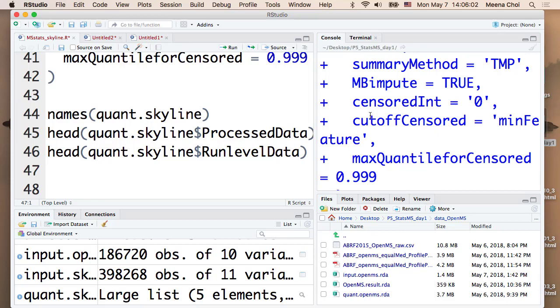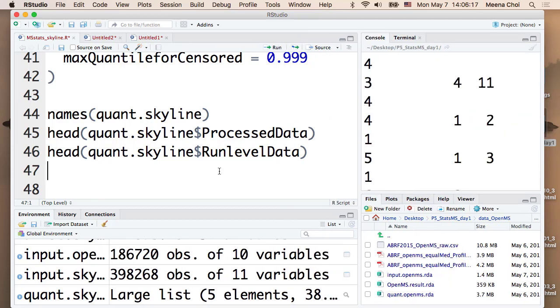Then what I want to do is a visualization of the data. After I go through this visualization, I will give you some small challenges, and then I will go over to the people who actually have the problem. So next one is what I actually use most frequently. So visualization.